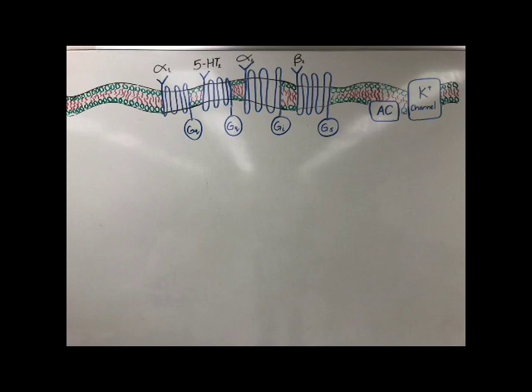Since ergotamine is a non-discriminative binding agent, agonist and antagonist to all of the receptors mentioned, it would make sense that the effects would be relatively unknown and would be dependent on the smooth muscle that is being tested upon. However, the primary physiology does not change in any form or fashion.